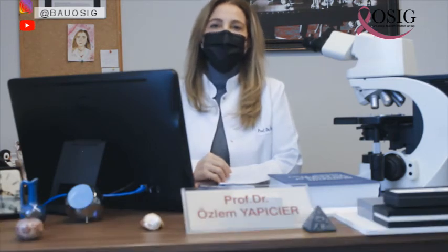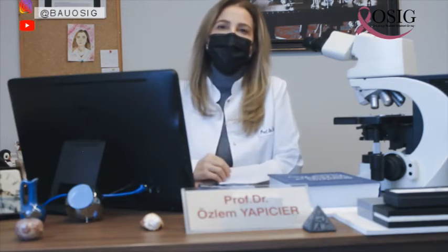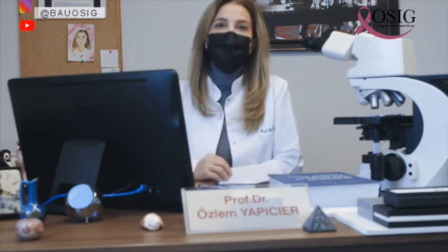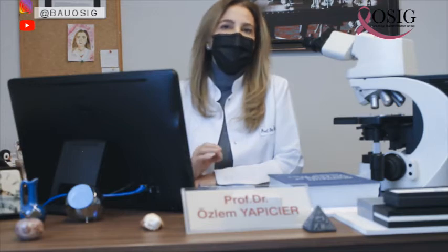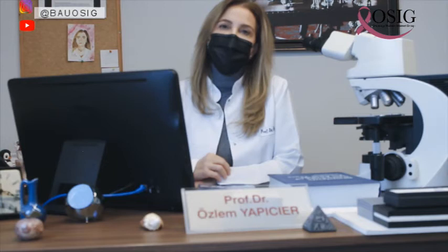Terminology for reporting cervical cytology was determined by Bethesda in 1988, and this system has been revised several times. The current system was developed in 2014. HPV testing was also incorporated into this screening system. The detection of specimen adequacy is really important.